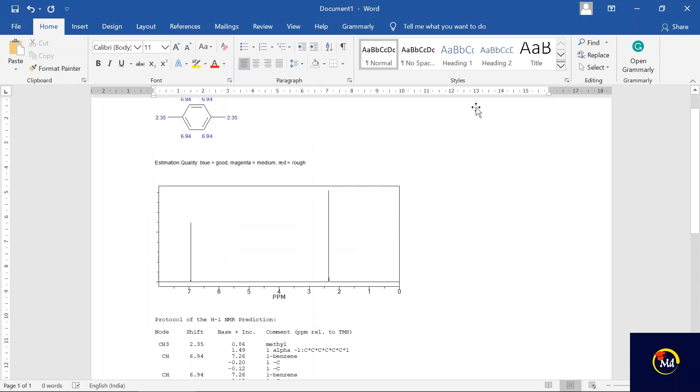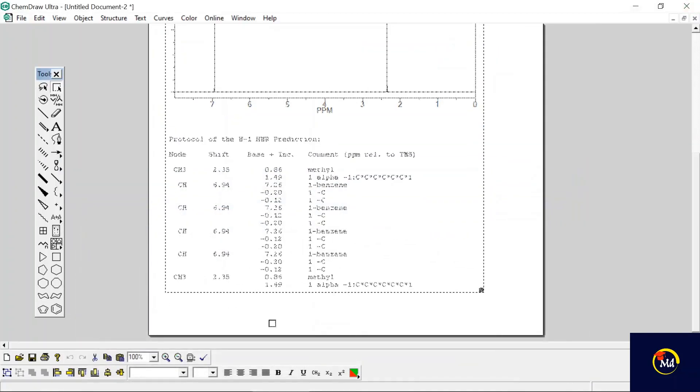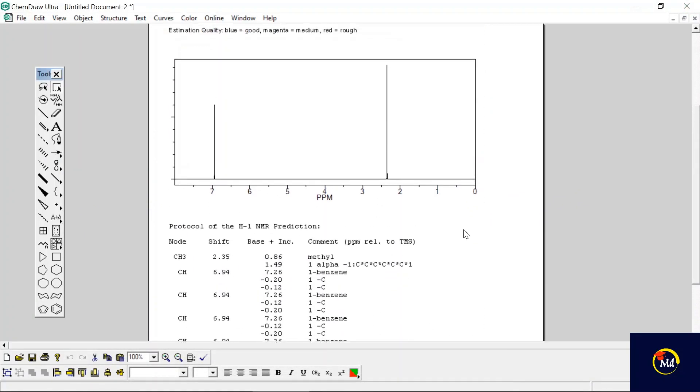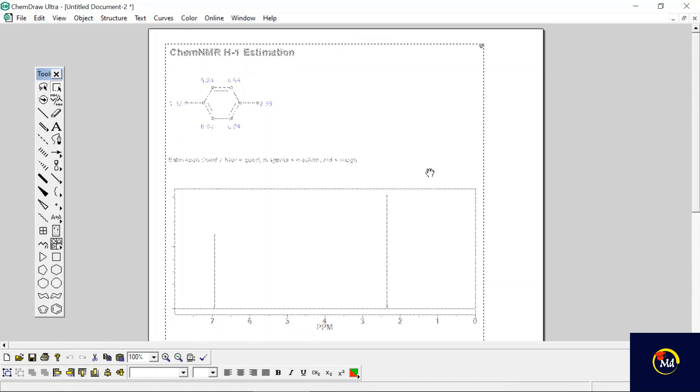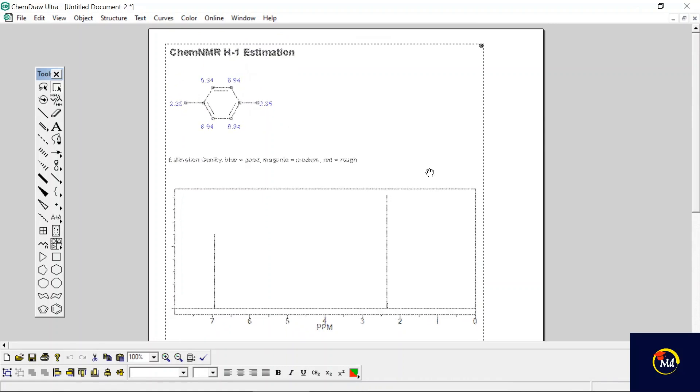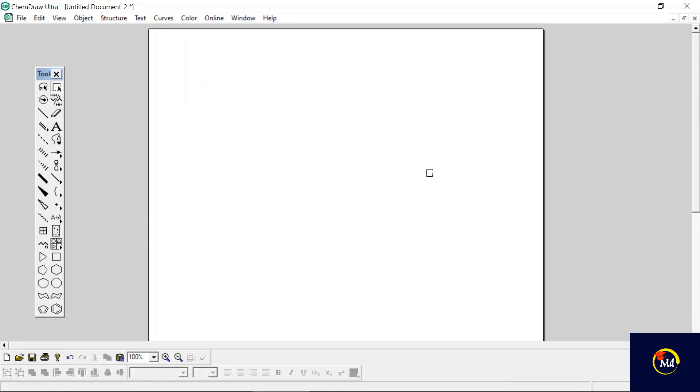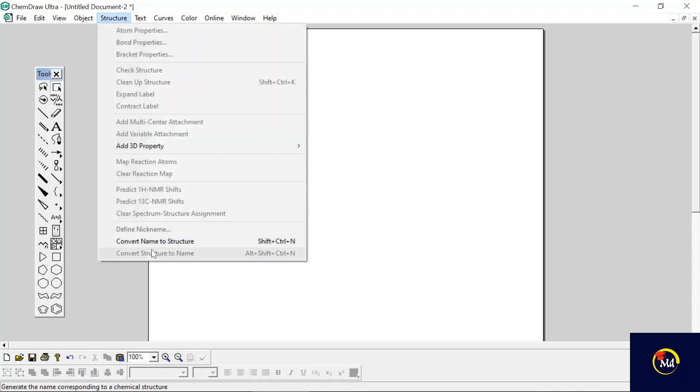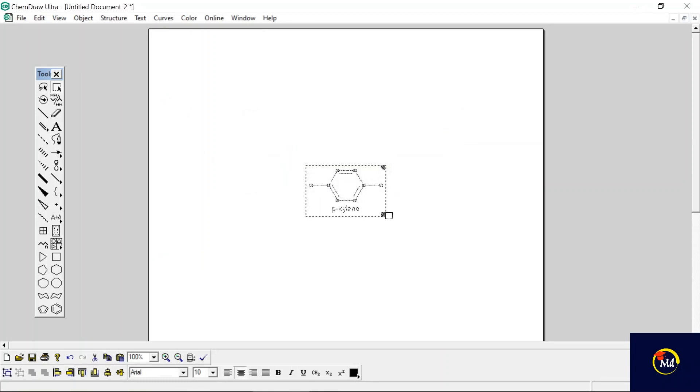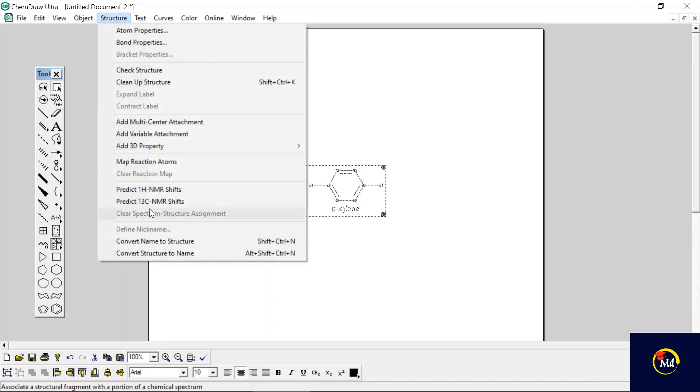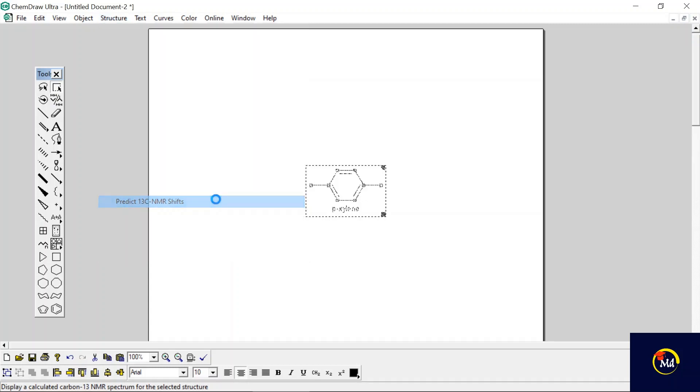Now suppose you want to see its carbon-13 NMR estimation. I'm just doing it for carbon-13 estimation. Again go to the Structure menu, Convert Name to Structure, write para-xylene, click on OK. The structure appears and then again go to Structure menu and Predict Carbon-13 NMR Shifts.